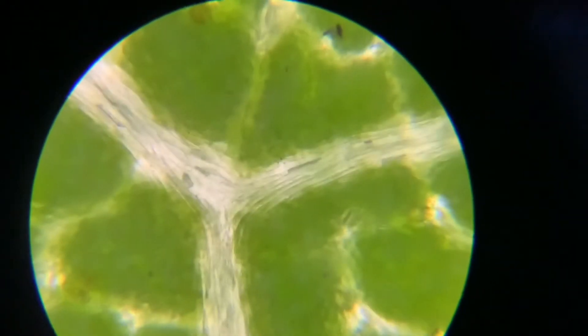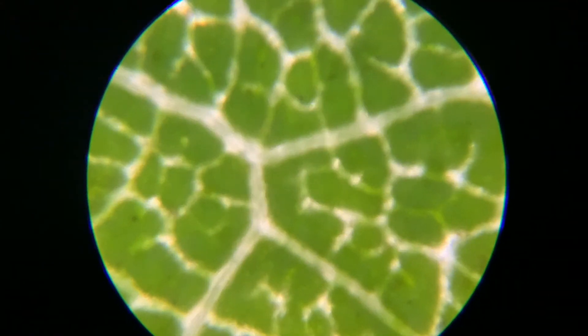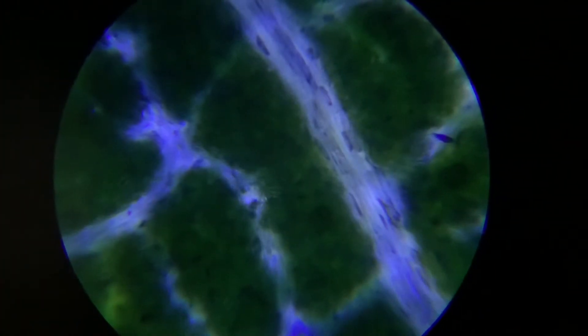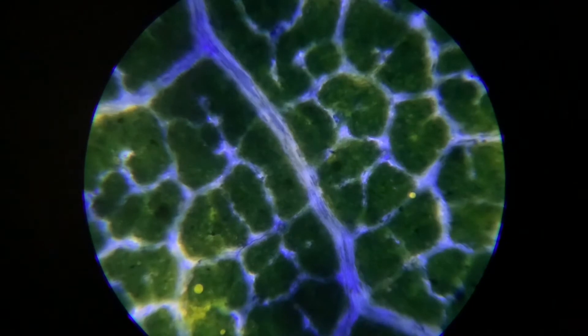It looks so cool — you can see what the leaf is made of. You can see the lines. Now we are trying it with the blue dye. Okay Daddy, come on, I can't see it. Oh! Now that looks cooler — a cell of a leaf! It looks very cool. Okay, next experiment!